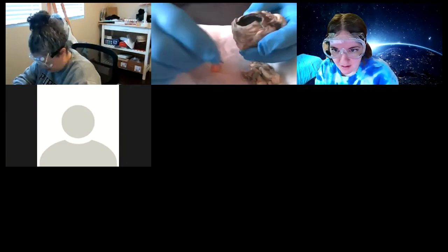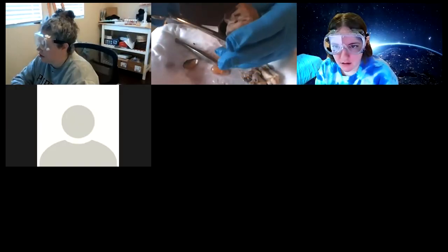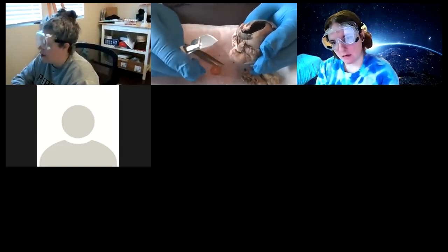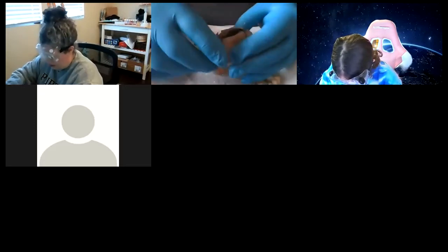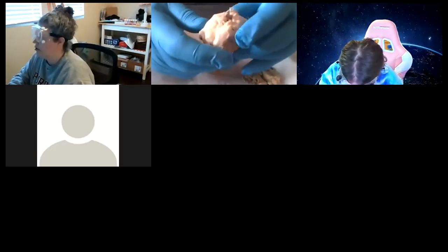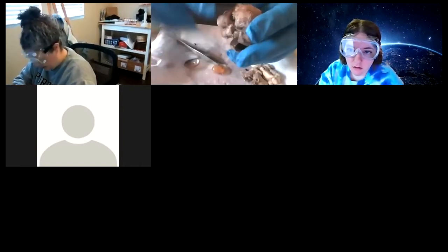Once we take the lens out, here's the hard part. You can try your scissors, but to be honest, I had a hard time. The sclera is so hard that I had to use my scalpel. The scalpel is very sharp — be careful, cut away from your fingers. Take your time — don't try to do it too quickly. I kept the optic nerve intact; I cut just adjacent to the optic nerve, going in from the cornea area.